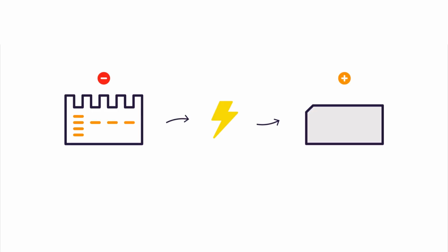Ultimately, what that means is that if we have too much SDS on our transfer buffer, those proteins may leave the gel but never bind to the membrane. They may precipitate before that happens. What that ultimately means is that they might fall to the bottom of my transfer tank before they even have a chance to bind to the membrane.